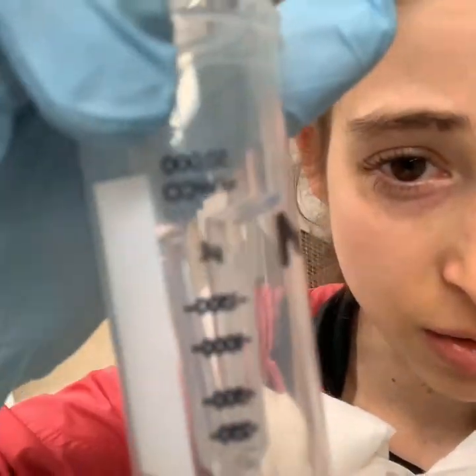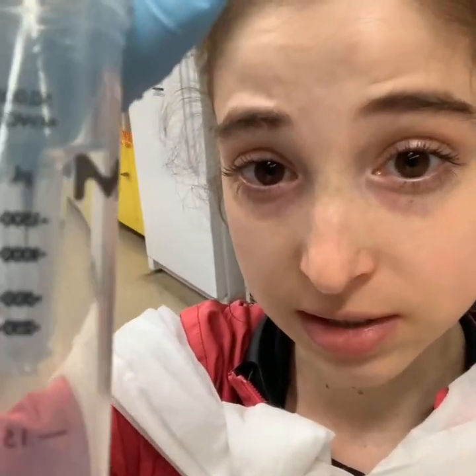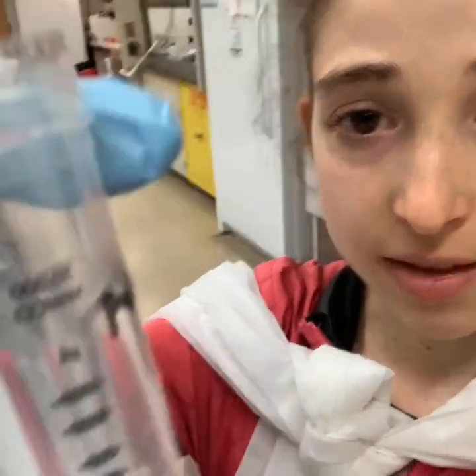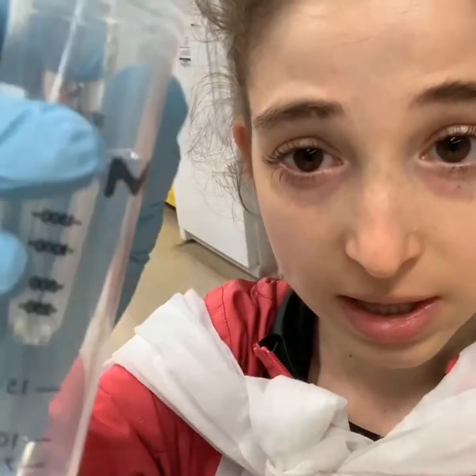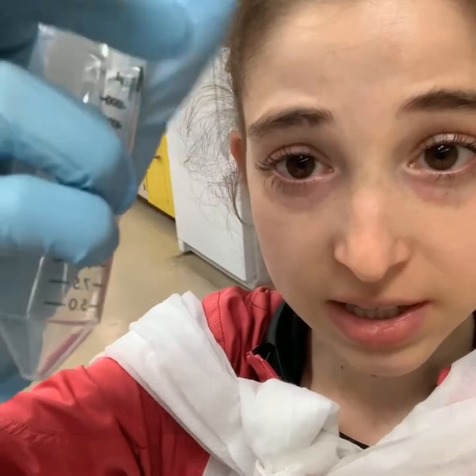You choose based on how big your protein is. That's where you get the MWCO — molecular weight cutoff. This one has a 50,000 Dalton molecular weight cutoff, so 50 kilodaltons. Basically you put your sample in there and when you spin it, it pulls the liquid out, concentrating the protein.